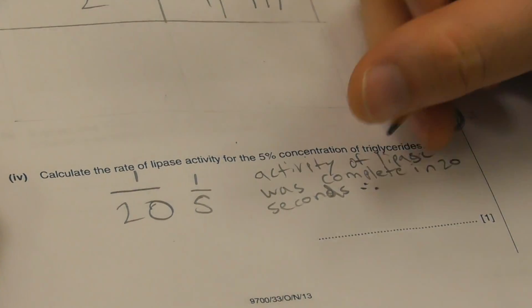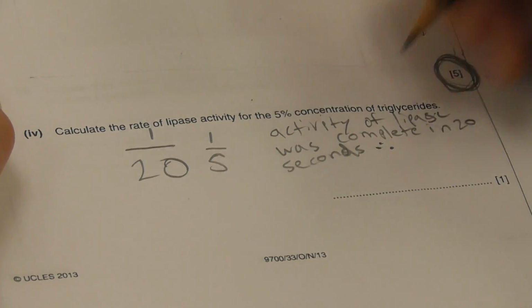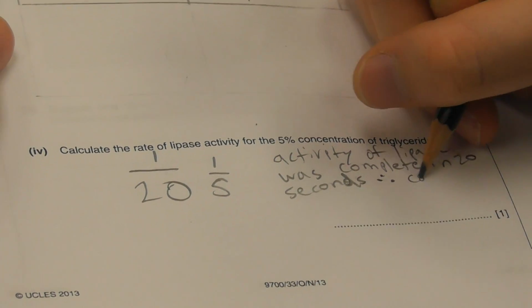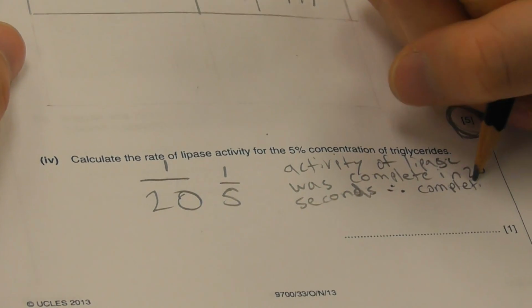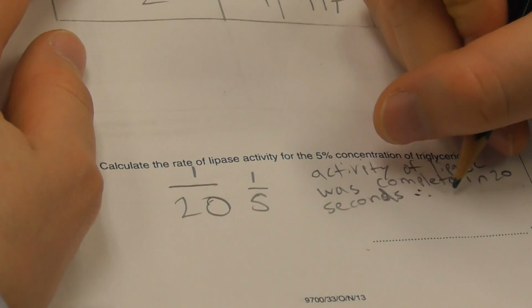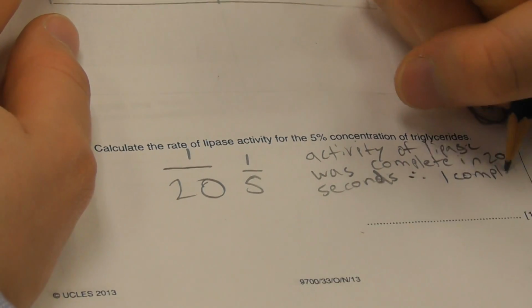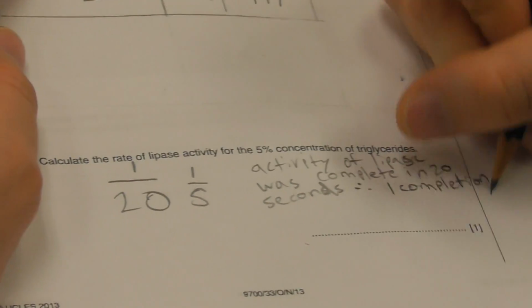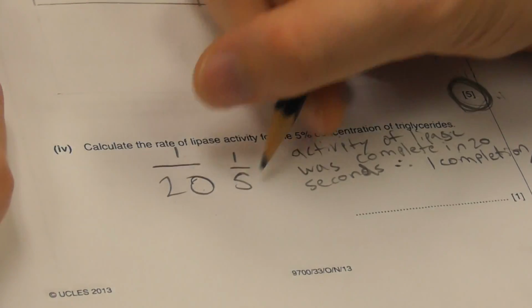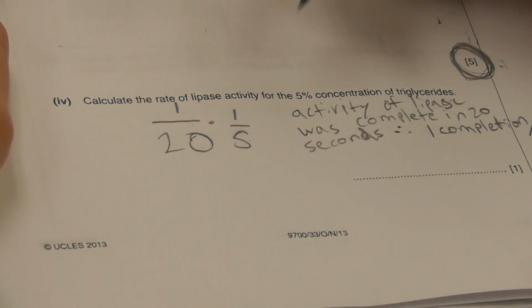Therefore, the lipase activity is one completion per 20 seconds. So if it's 1 per 20 seconds, that is the activity of lipase.